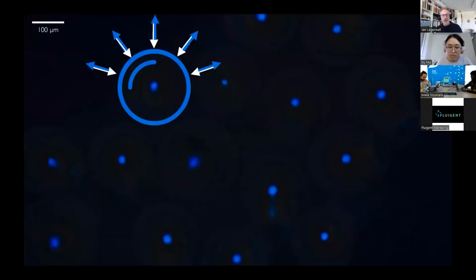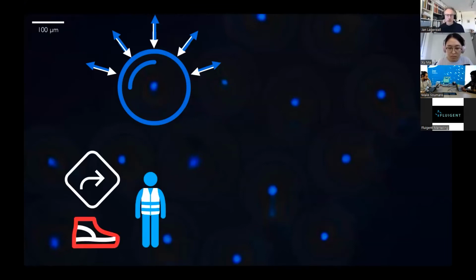And this relies on the central reflection spot. Because these are spheres, they're actually retroreflectors. No matter in what direction you are sending light into the sphere, you're getting light back to the light source. And retroreflectors, we know them, we have them everywhere, right? We have them in road signs, in fancy clothing, in safety vests in your cars, but these retroreflectors are indiscriminate retroreflectors. They reflect all light. They reflect white light. So that's why they are so incredibly bright.